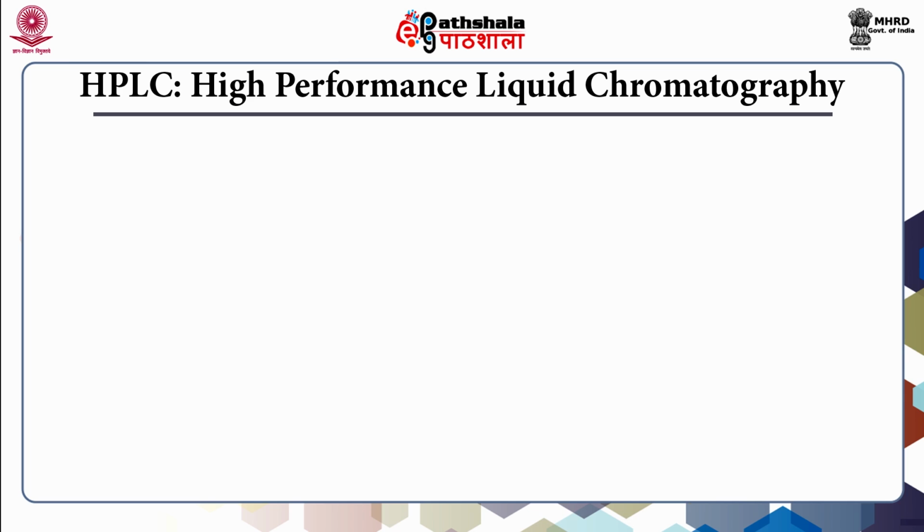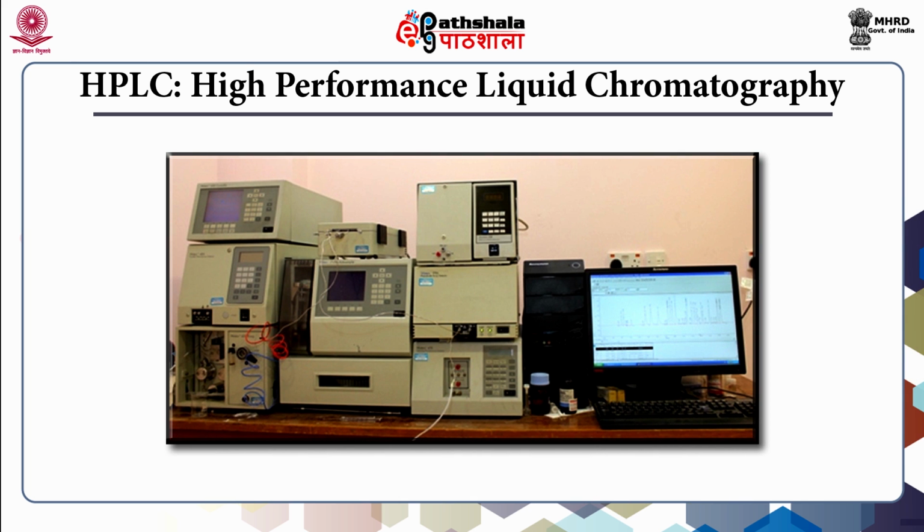Let us start our lecture with an instrument of HPLC, how it looks like. So, in this slide we are showing the typical HPLC instrument. You can see a computer screen and different pumps and column and also detectors. They are all the different parts of the HPLC instrument.